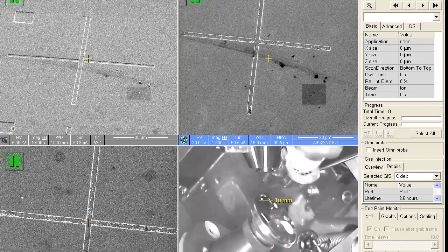This video is really for the intermediate user, and I would say come back to this every now and then, learn a few shortcuts. Definitely learn the top 3 shortcuts, which is just basically positioning the stage under the electron beam or the ion beam, and then the pause and unpause button. And then anything else you learn is basically going to help you out through the whole process.